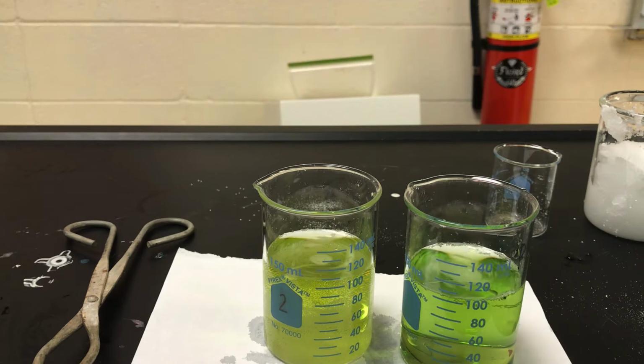Here we have 2 approximately 100 ml samples of water. They're a little bit bubbly because no one's used my water all summer, and so it just gets that way. And I've added a pH indicator, and they're both approximately pH 7. Green is about pH 7, so one beaker is a little bit lower in pH than the other, but they're similar, right? So now what we're going to do is we're going to take these 2 beakers of water, and to each beaker we're going to add different chemicals, right? And we will observe what happens.